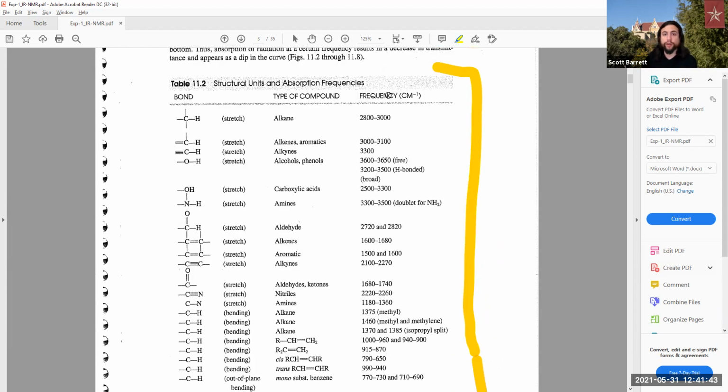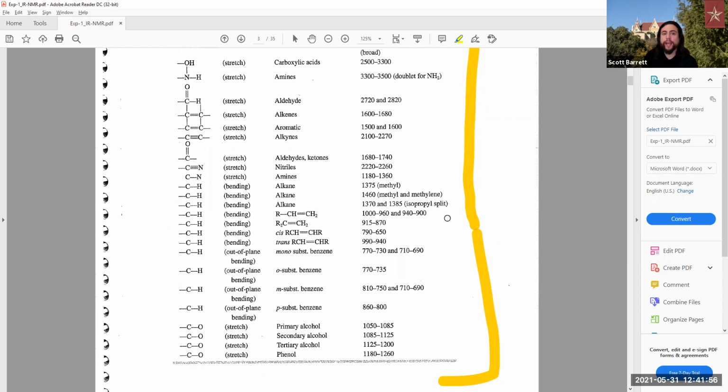So please go through and make a list and then understand, like I said with the alkanes, what is more common in all compounds that you look at and what is more uncommon, like the nitrile example. And then once you've done that, you have a good clear path of what you need to memorize precisely. Because if you have interfering patterns in the same region, it's not very helpful to say that you can make a clear, distinct analysis of a given compound.